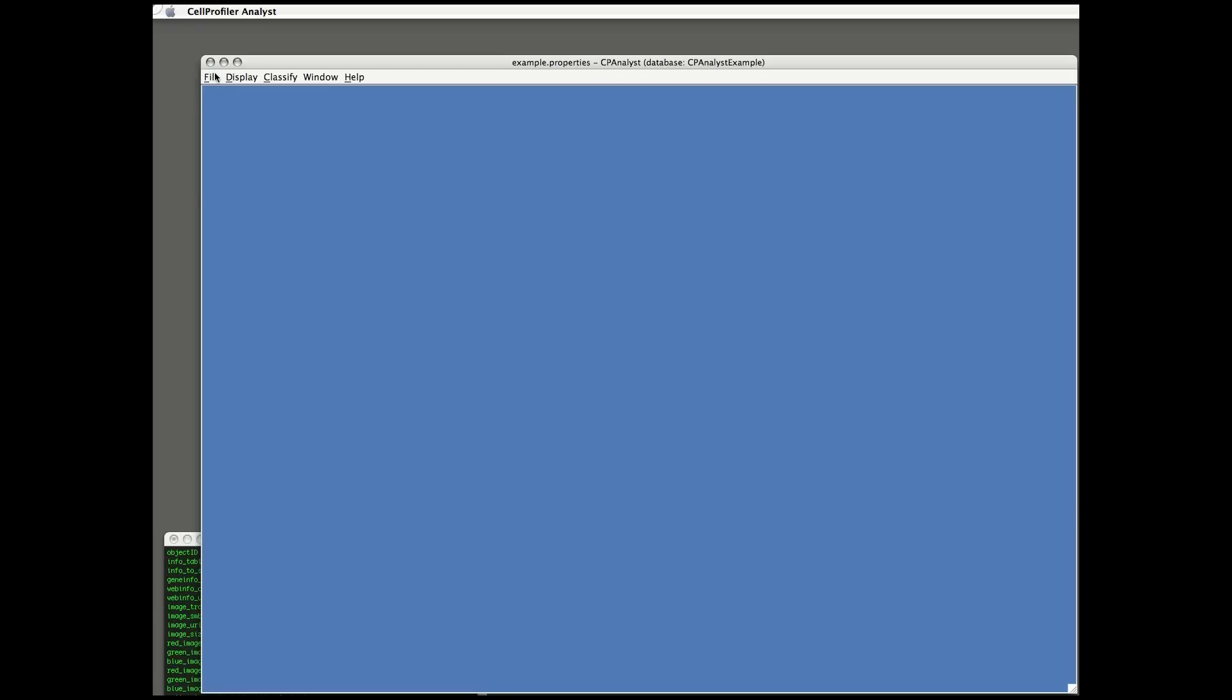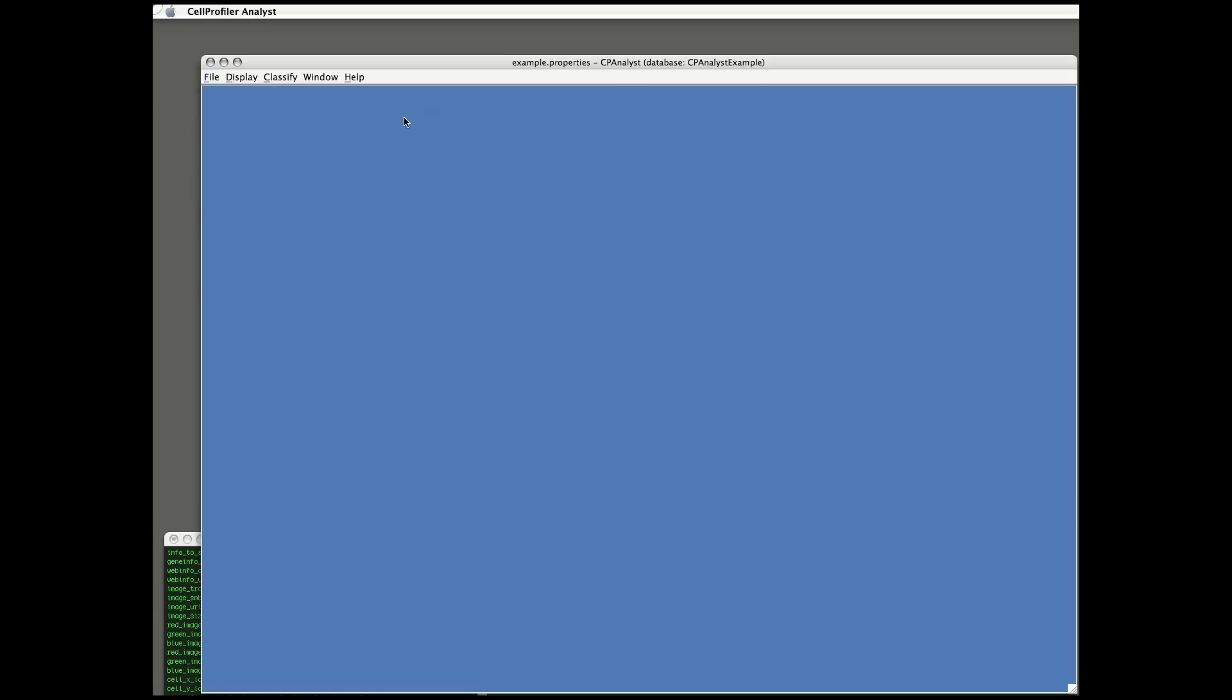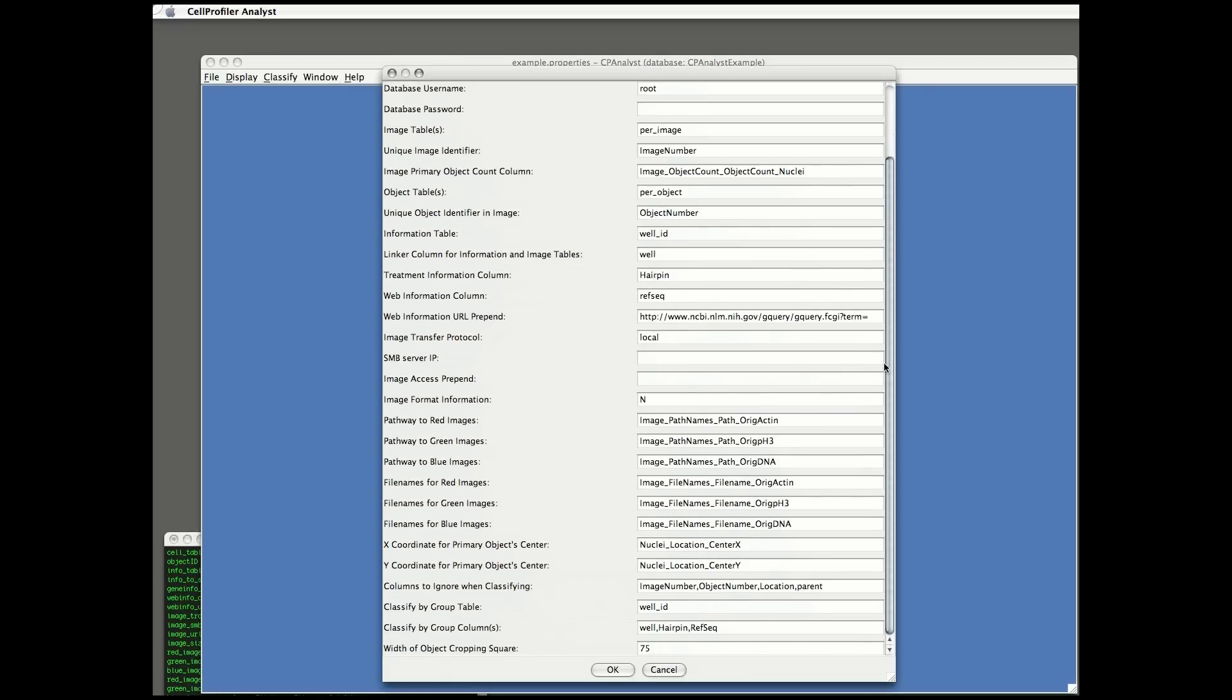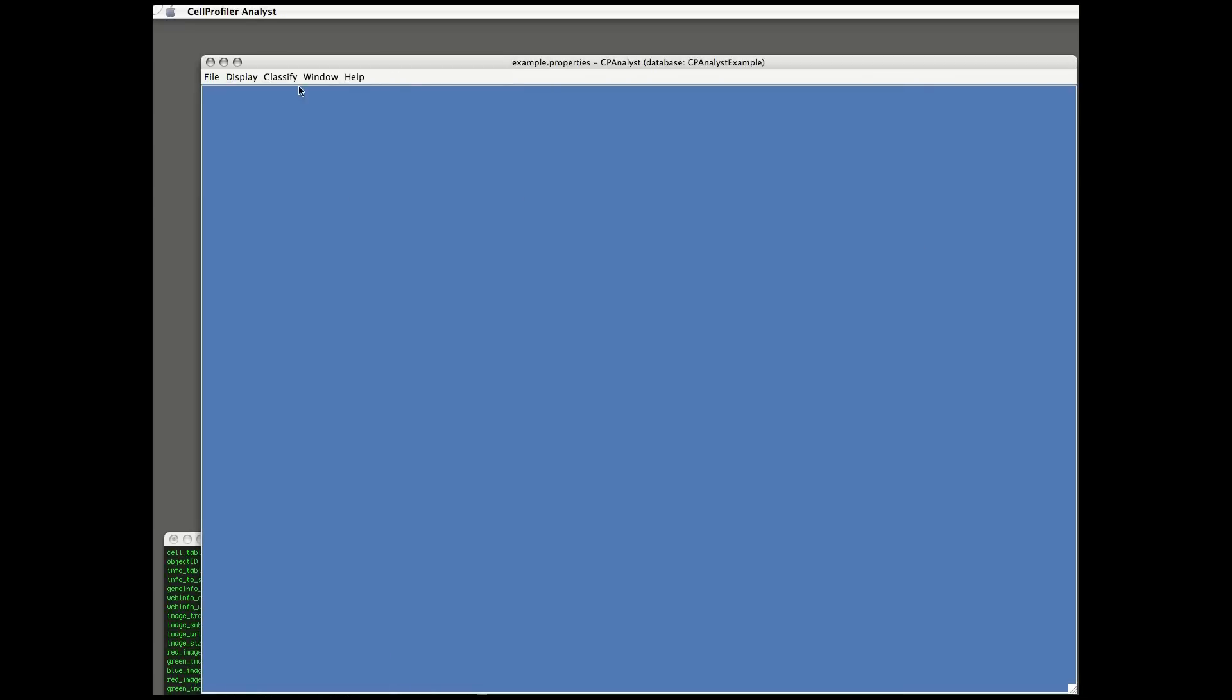When CellProfiler Analyst opens, you need to choose the properties file which tells the software where your database is located and various properties about your data. You'll probably need the assistance of your local database administrator to get this file set up properly.